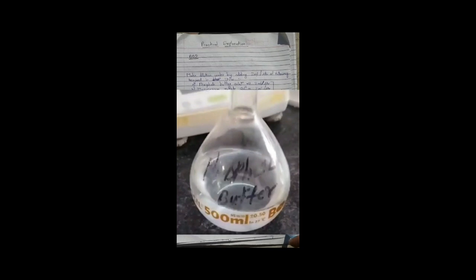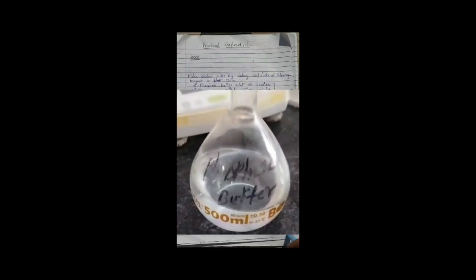Here we discuss how to make the dilution water by adding 2 ml per liter of the following reagents to the distilled water. First you have to prepare the phosphate buffer solution, 2 ml per liter, then magnesium sulfate solution, calcium chloride solution, ferric chloride solution. That means you have to add 2 ml of each of these solutions to 1 liter of the distilled water.